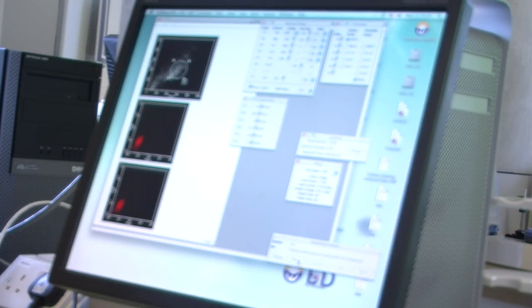Is this positive cell line similar in cell type to the test cell line? They seem to have quite similar forward and side scatter profiles. That doesn't mean they're the same. It's a bit like if you're spotting animals in the wild. If you see it's got spots, it doesn't mean it's a leopard. But it shows similarities with leopards.